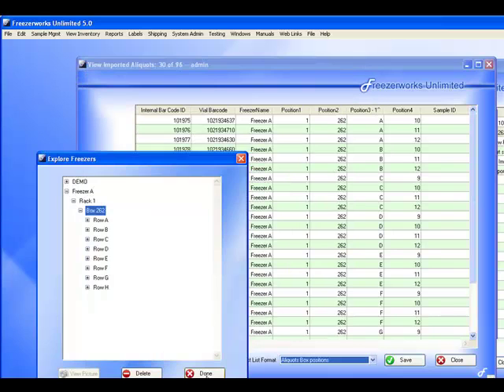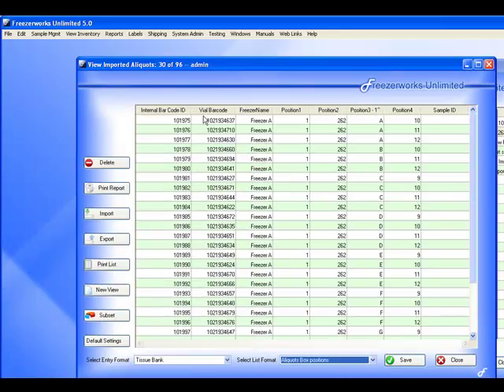So again, the key is to, when you import, make this a unique number. This could also be a sample field, and you could still create these. If you want vial barcode to be a sample field, it will work as well.